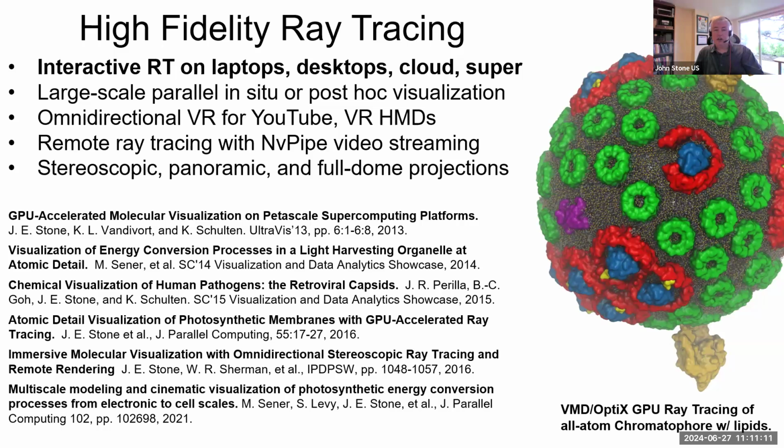Ray tracing, I'll get into in a little bit, allows us to do visualizations that are more informative. So it isn't just that they look nice, but they're easier to interpret. And I'll talk a little bit about that as we go along. Some of the things that are nice about ray tracing are that we can parallelize it on state-of-the-art GPUs and similar hardware. Ray tracing can allow us to do things like make 360-degree panoramic videos like we would use for YouTube to use with VR headsets.